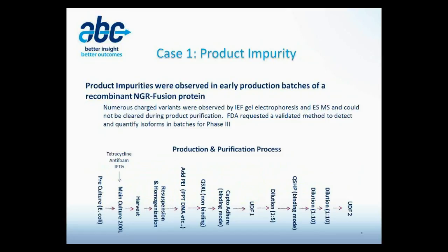Now, in this talk, I'll be talking about 2 case studies, mainly for product impurity, and then Dr. Anders will come in the middle of the talk, and he will talk about an impurity based on the process. So case 1.